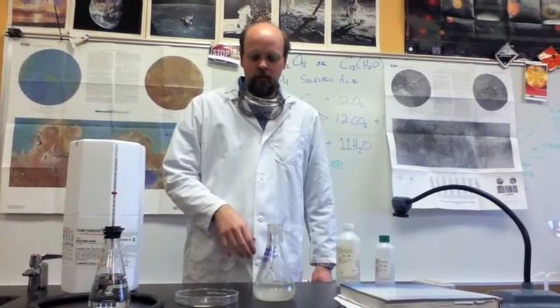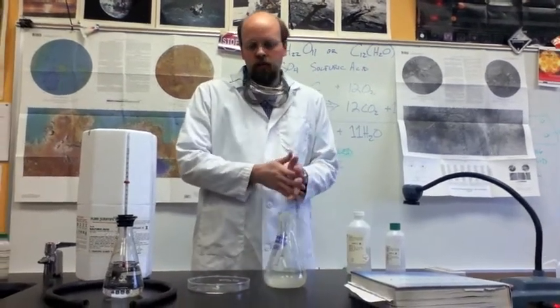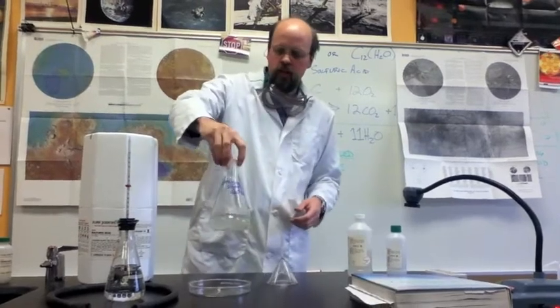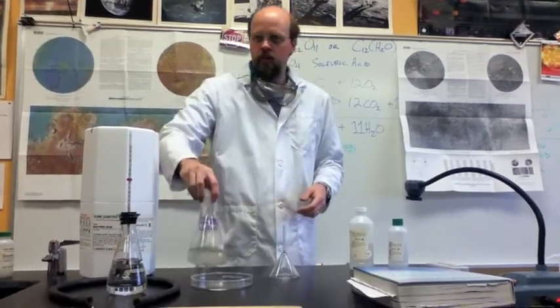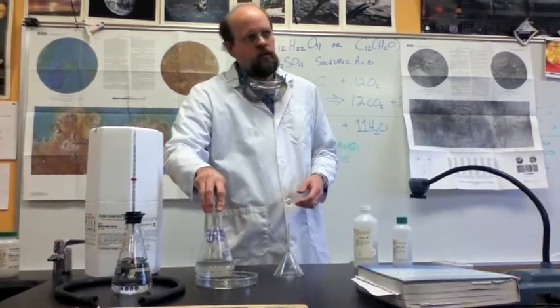We're going to do a little demonstration of the crystallization of supersaturated sodium acetate. I have sodium acetate dissolved in this solution here.